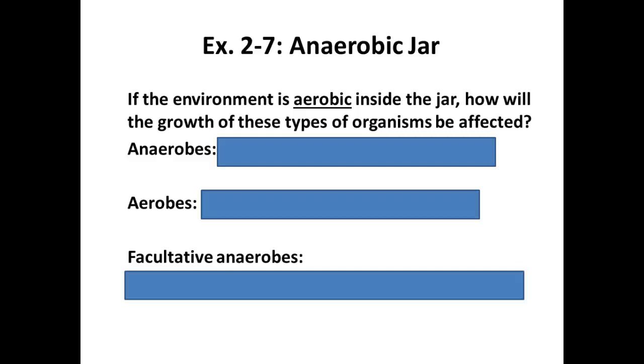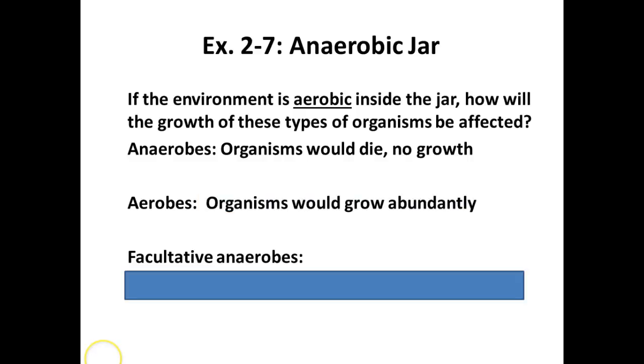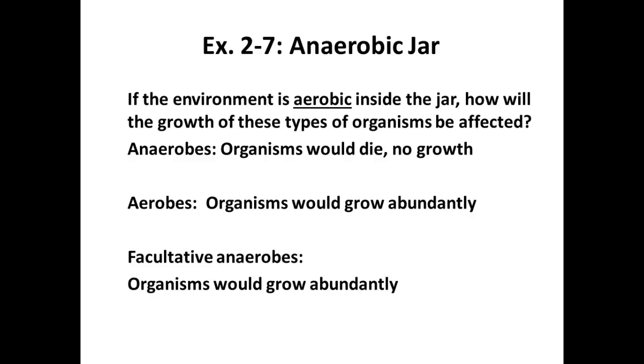It's going to die, right? It's going to die. No growth. Your aerobe, on the other hand, which you would expect to die in this jar, would actually be growing quite abundantly. Same thing with your facultative anaerobe. Instead of its growth being slowed down, under aerobic conditions, it's going to be quite abundant, right? So you're going to see all this increased growth.